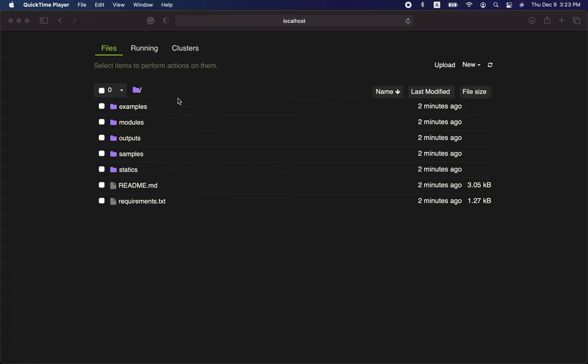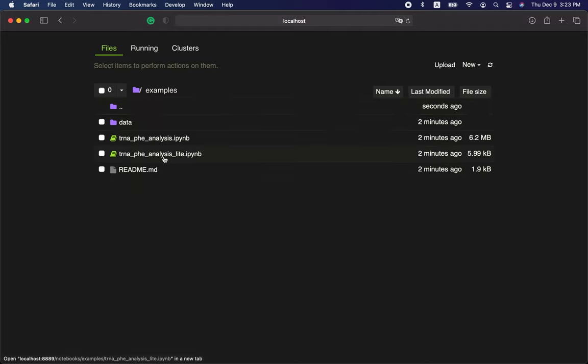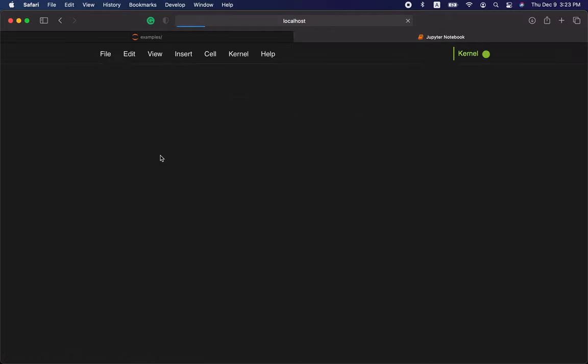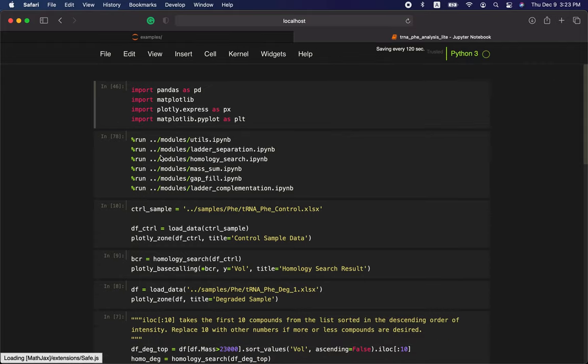This is the mlc-seq project. We are going to explore an example which is the simplified version. Now we open this notebook.